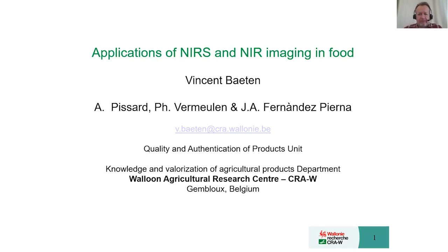Good morning, everyone. Thank you a lot for the introduction, and I'm glad to be here with you online. It's great also to give you a small introduction of what we can do with vibrational spectroscopy, and more exactly with infrared, near-infrared spectroscopy and near-infrared spectroscopic imaging. So my name is Vincent Baeten. I'm working at the Walloon Agricultural Research Centre.